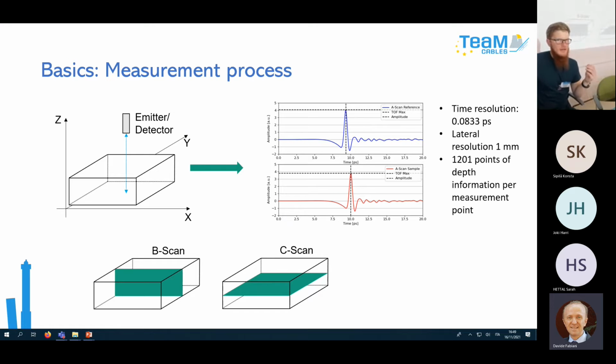Yeah. In theory, yes, but we are not measuring the thickness with this method, right? We are doing that manually. That's where our big measurement error is coming in, because we are using a micrometer screw. In theory, I could imagine measuring a sample right on with the micrometer screw, just scan it by hand, for example, or use some other method like maybe a laser profilometer.